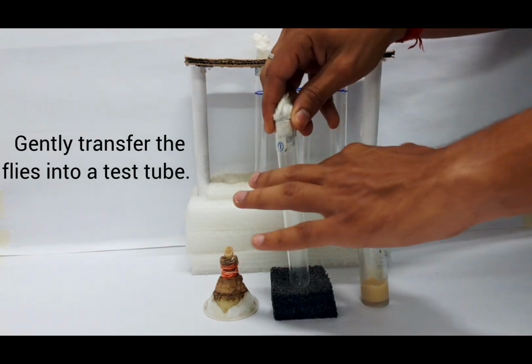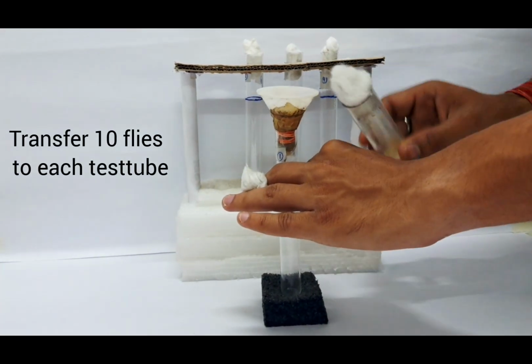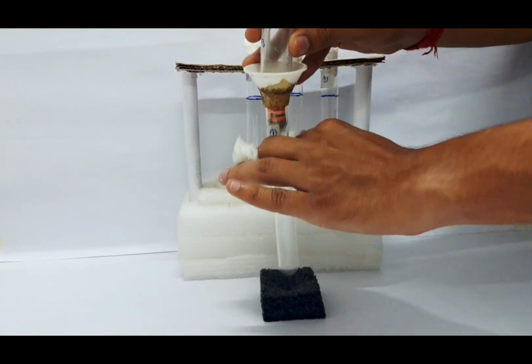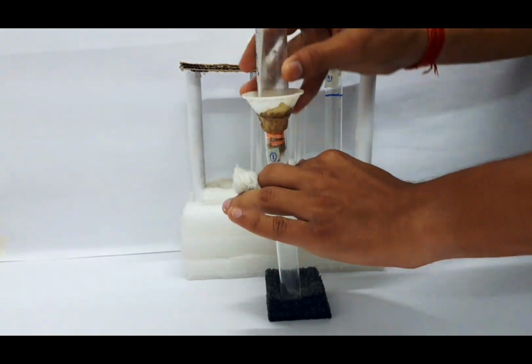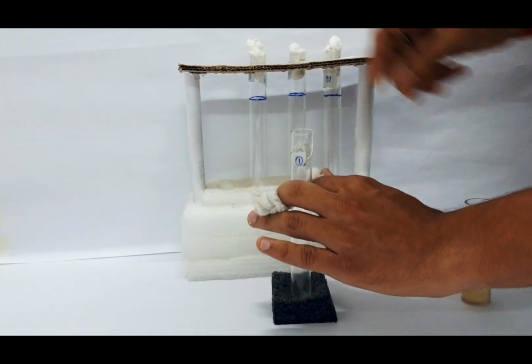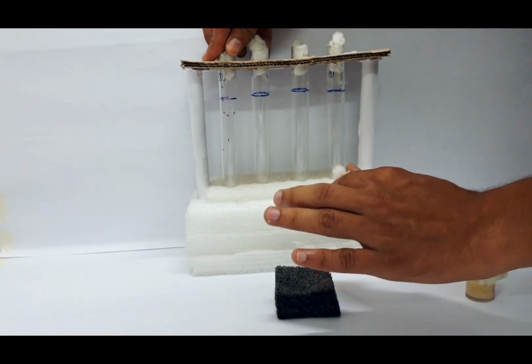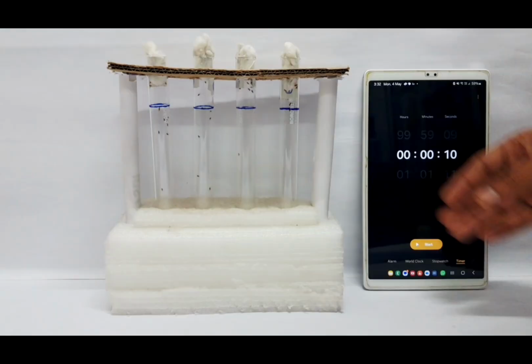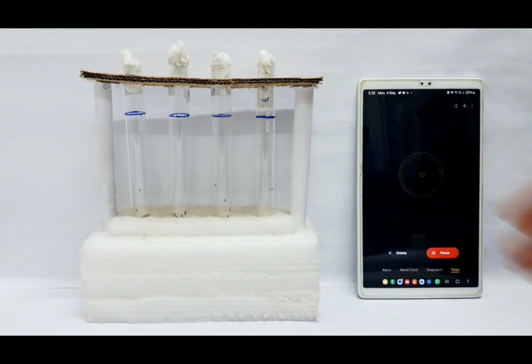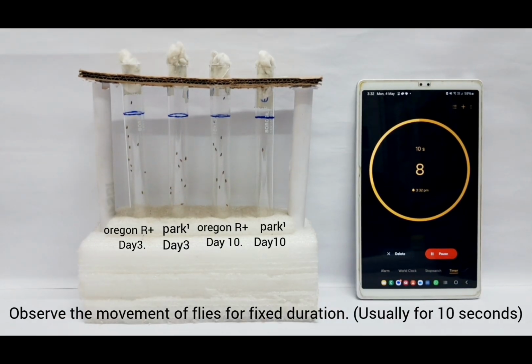So the experiment starts with gently transferring the flies of different strain to different test tube. Make sure while transferring the flies into the test tube, gently tap it on a foam so that it do not break during tapping. At last, the flies are tapped gently to bring them to the bottom of the test tube and observe their movement for a fixed duration, usually for 10 seconds.